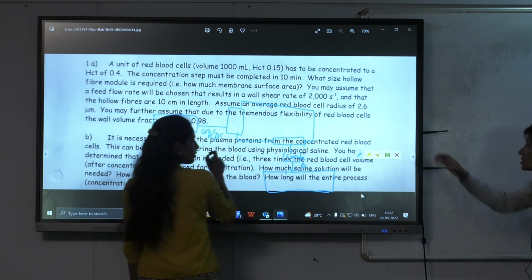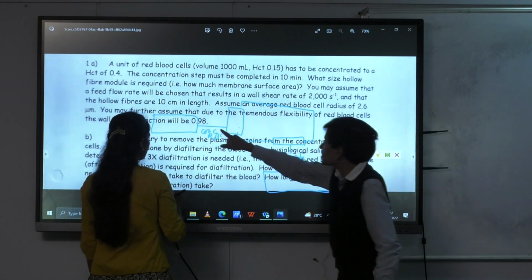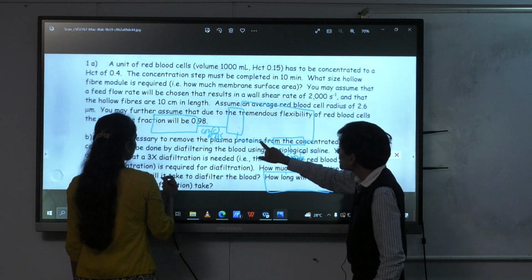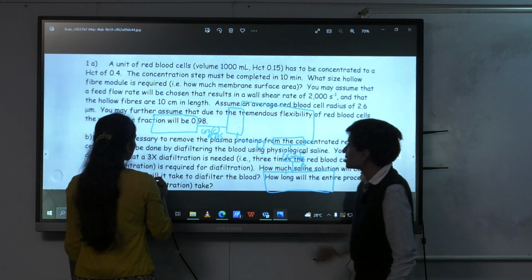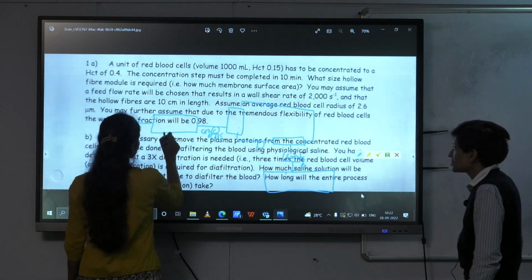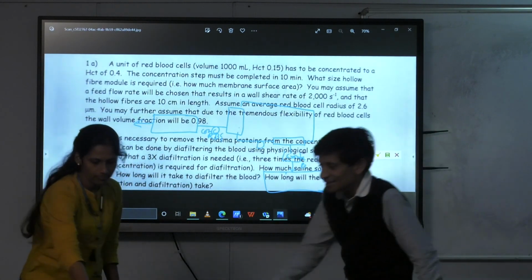That's fine, yeah. So that's going to be your saline that you're pumping in, right? And so probably you need to put a pump here. There'll be a pump there, that's okay. We didn't put it before, and there was also actually a pump here because you were pumping through this. So there are 2 pumps now, right? That's it, nothing more. That's it, yep. So can everyone see that?